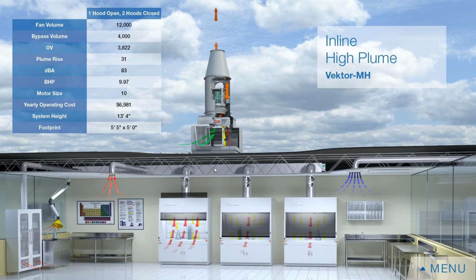But where Antec will fit in now, they're the valves on top of the hoods, as well as the supply side. So, they're controlling that room static pressurization, and they're helping maintain that velocity. So our little valve opens and closes here based on the sash position. And you're going to get a lot more of that detail this afternoon.